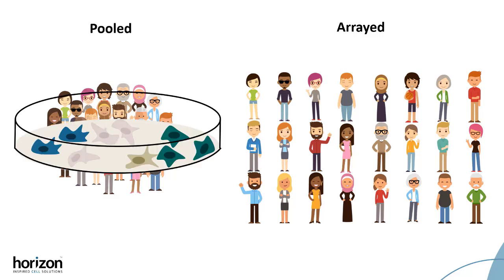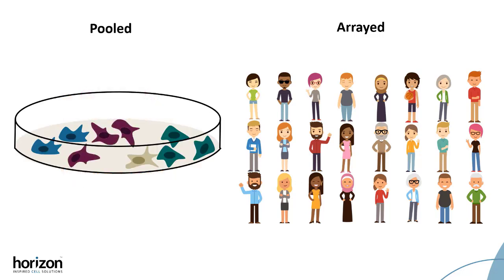Pooled screens using cells finds obvious differences, like cell death or cell survival, because missing cells and those growing out of control are easy to see. Less obvious things can only be found by marking the cells with certain things like antibodies or fluorescent reporters.